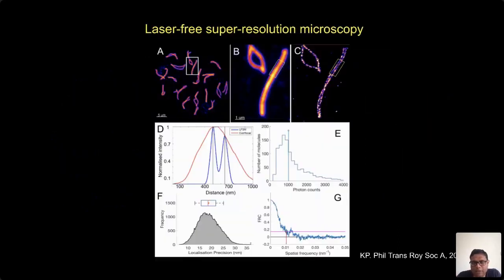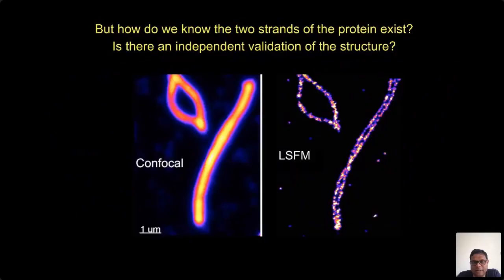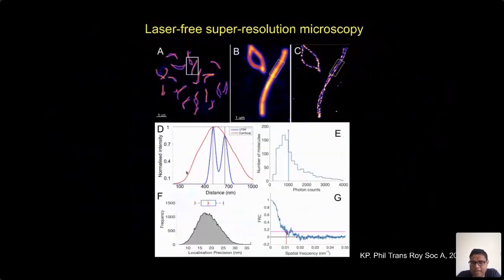And then we can do some interesting statistics, which is basically you can do all this full width half maxima analysis, what distances you are getting. So this is in this cross section of the image, how many photons. So we are roughly getting like 1,000 photons.